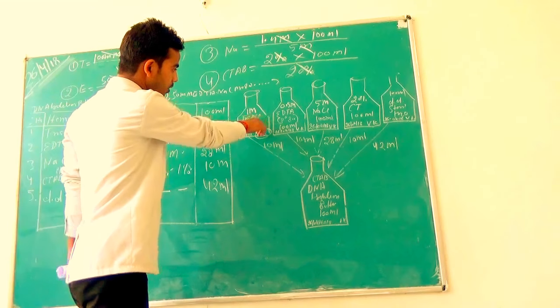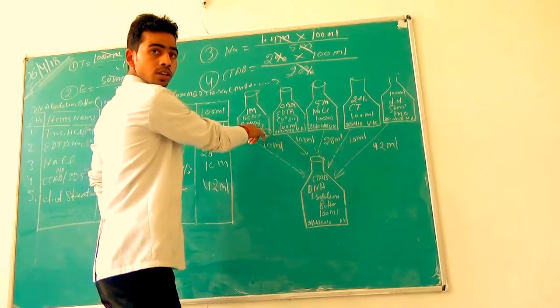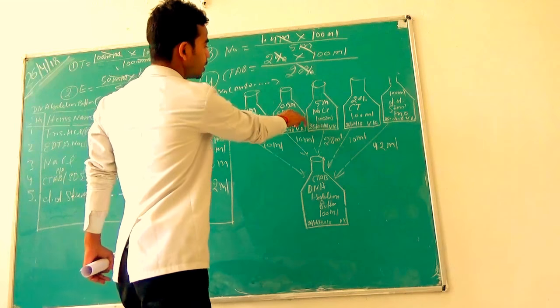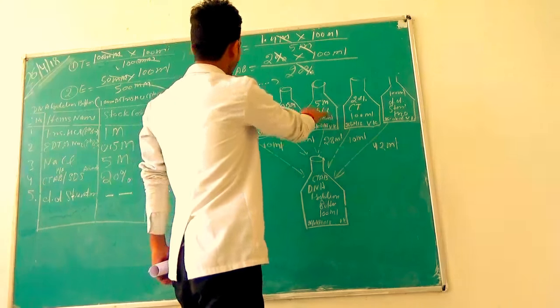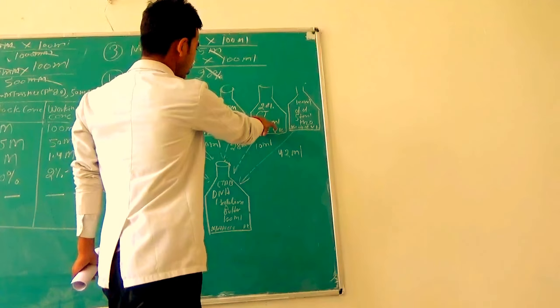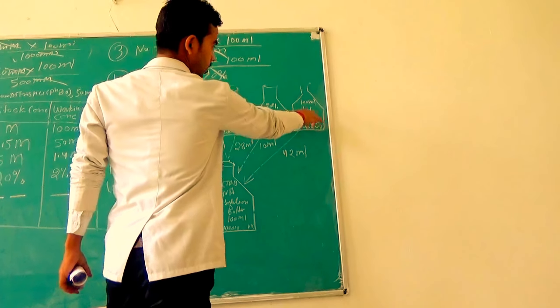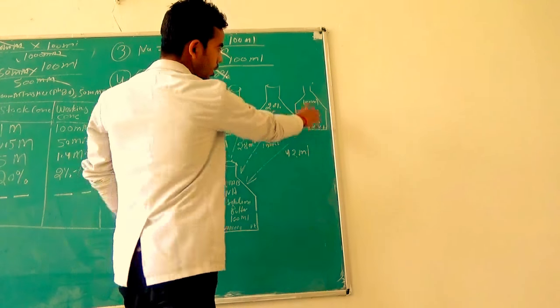First product is Tris HCl solution, pH is 8.0 and 100 ml. Next one, EDTA, pH is 8.0, 100 ml. Next, NaCl, 100 ml. And the concentration also has to be read, 20% CTAB and 100 ml. And double distilled water, 100 ml.